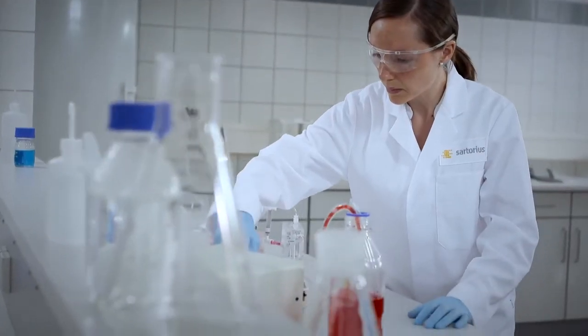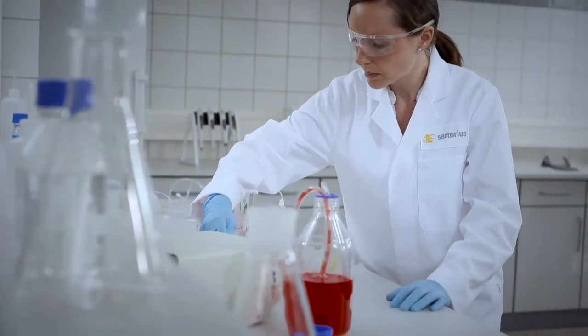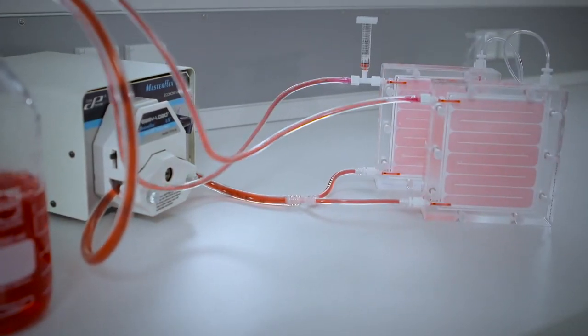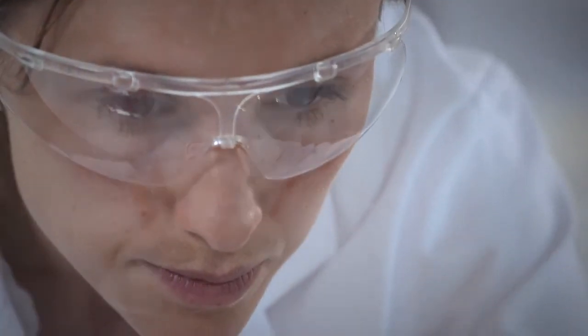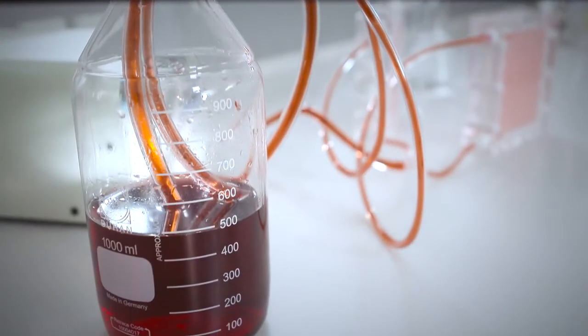The sample now recirculates through the two VivaFlow 200 cassettes while the filtrate is collected in a separate vessel. Since the sample is red, you can watch the color turn darker as the concentration of the sample increases.